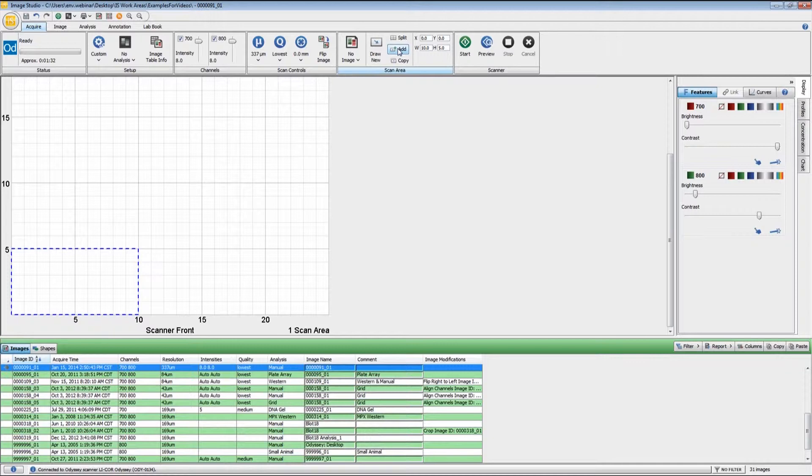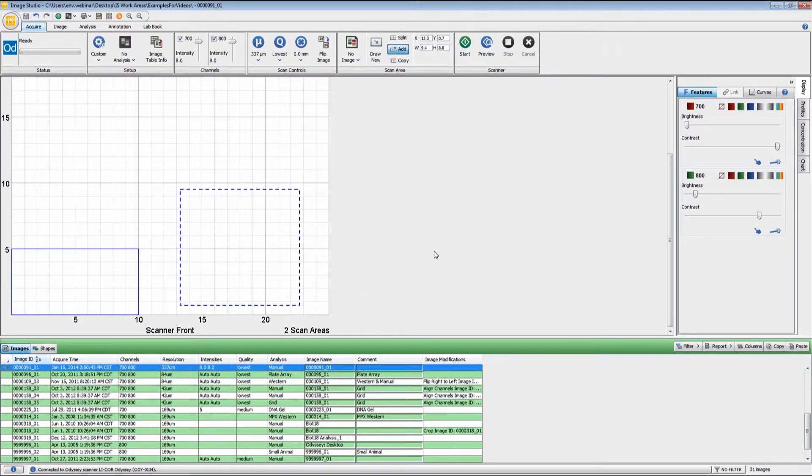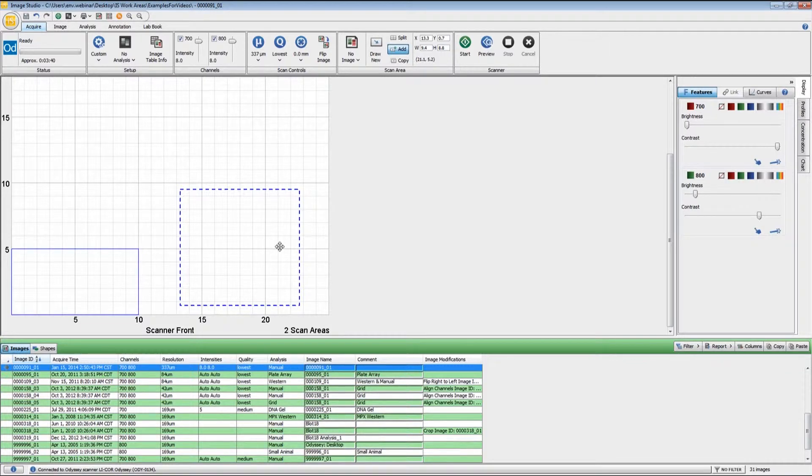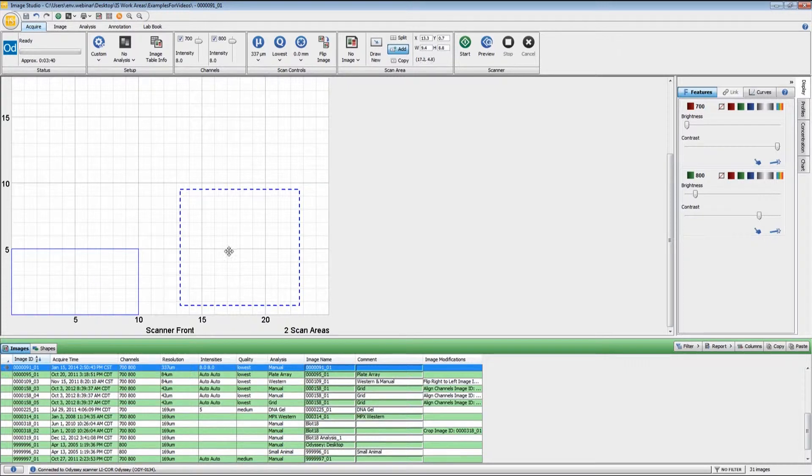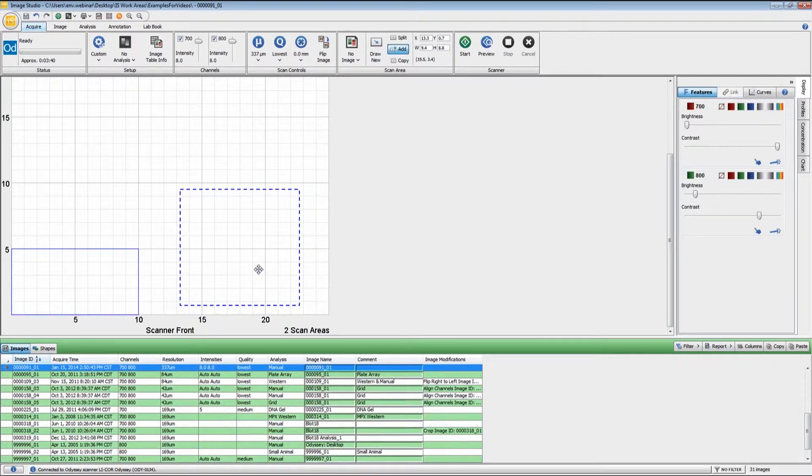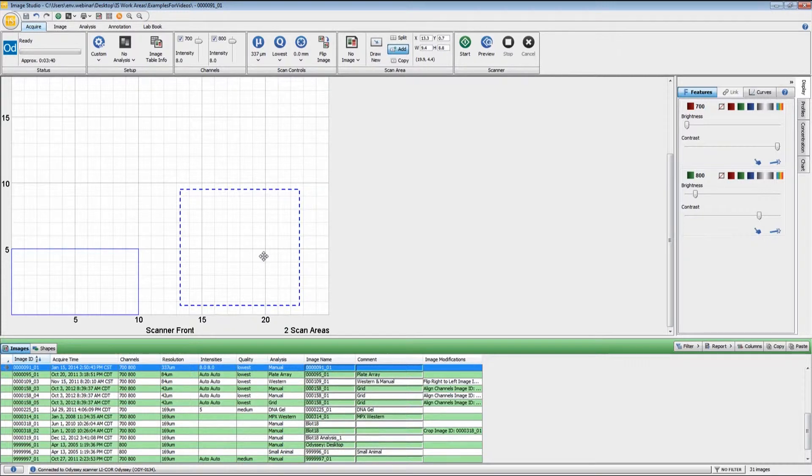If you have more than one blot that you want to scan, you can click the Add button right here and draw a secondary scan area. If your blots have widely differing amounts of fluorescence, this may not be your best option, because it will use the same exact intensity settings and resolution settings for both of the images. But if both of your blots have approximately the same amount of fluorescence, you can use this to save yourself a little bit of time because it will generate two separate acquisition files for you. For right now, I'm just going to go with one acquisition.